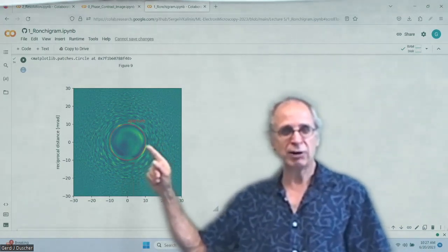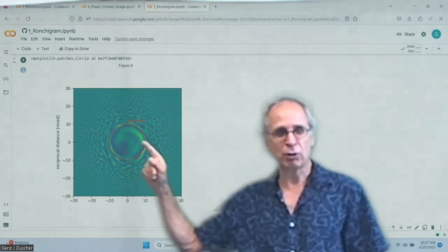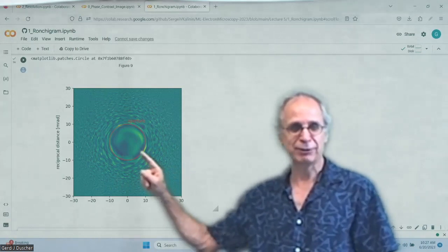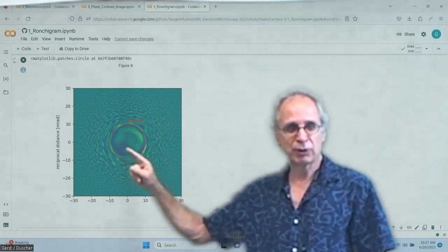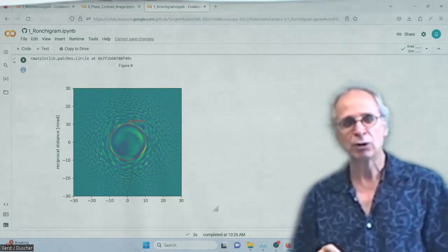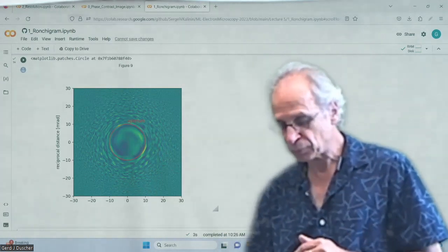And so you can see we have a very coherent part here. So it looks very blobby, and it looks in the microscope exactly the same way. You cannot mistake that, okay? And that is the diameter, or the size, of the aperture that you can use now to form a very small probe.